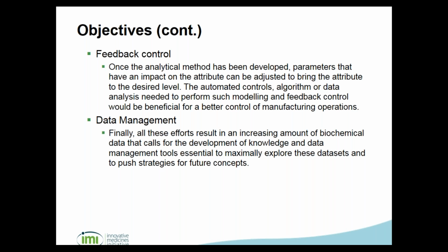And then coming to data management, of course, if you do these online measurements and you measure, for instance, let's say every minute or every 5 minutes or even every half an hour, you have a lot of data, and we have to make sense of those data. So we are also looking into data management tools, but also knowledge tools, because that is where it's all going. So we want to build more knowledge on the upstream cell culture to get a better control of our production and also of the critical quality attributes of our products.